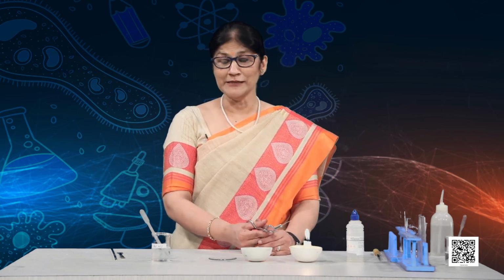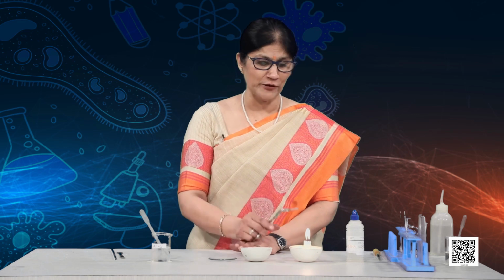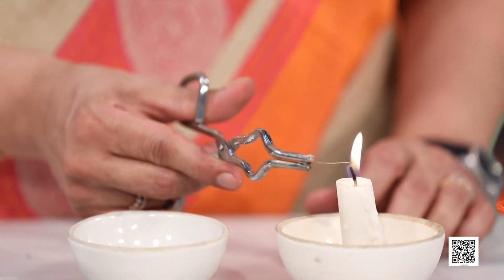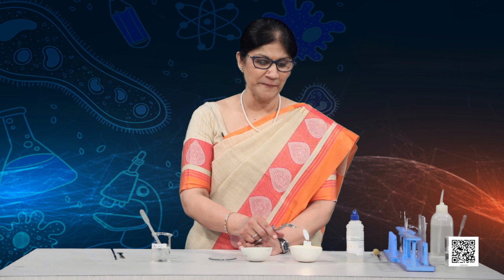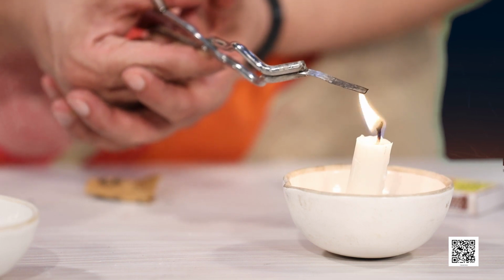burn it with a candle. Okay. Right now I have a candle with me. You can use a Bunsen burner if you are doing it in the lab, or a spirit lamp. The experimentation, my dear friends, should never be stopped. Okay. And where will I keep it? Which part of the flame is the hottest? Yes, it is the topmost part of the flame. So, I have to keep my magnesium ribbon at the topmost part of the candle flame, because it is the hottest zone, again connecting with the previous knowledge, isn't it?